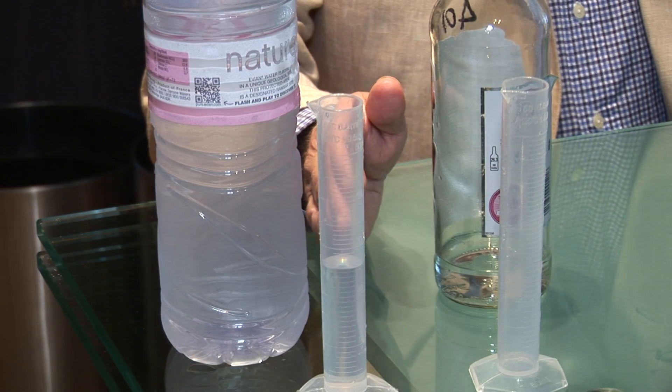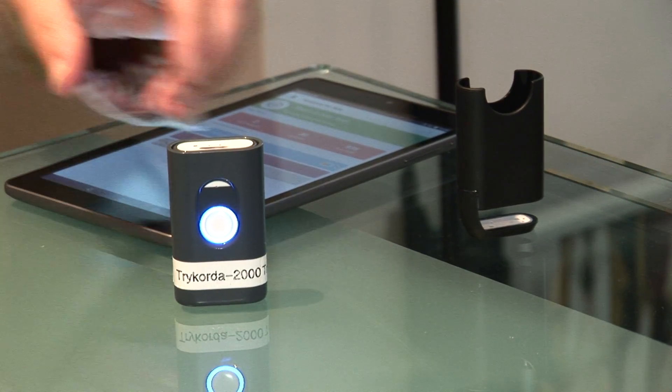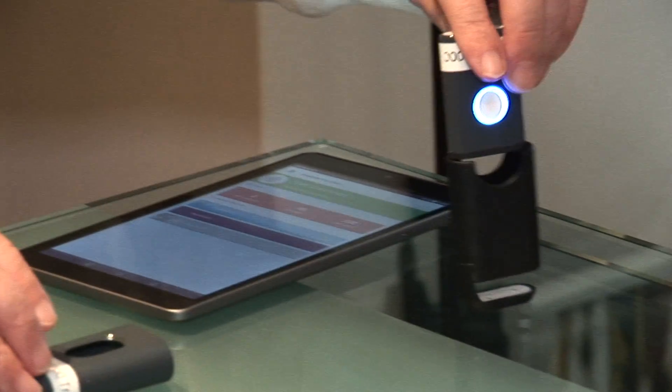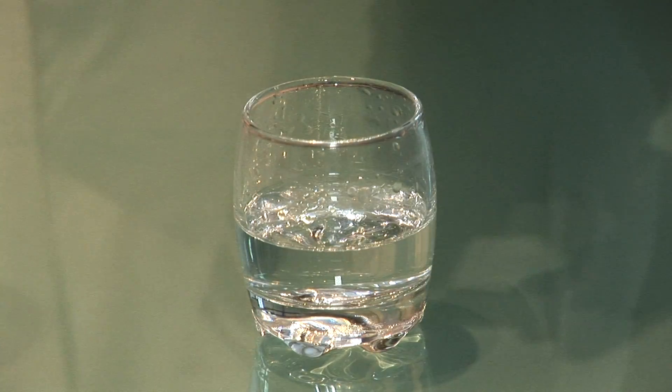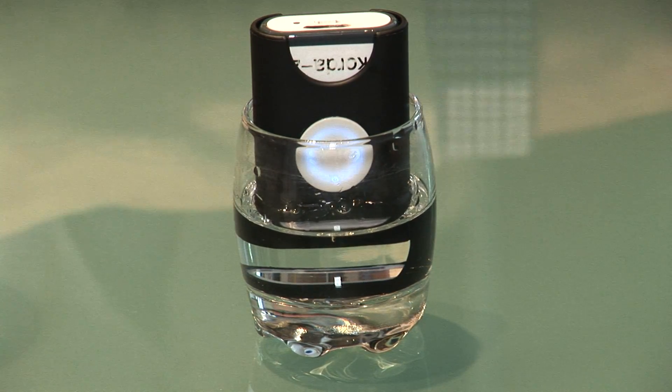We have a similar measure of water which we'll use in a moment. Here we have the near-infrared scanner, which I will place in the liquid accessory and place that in the sample glass.